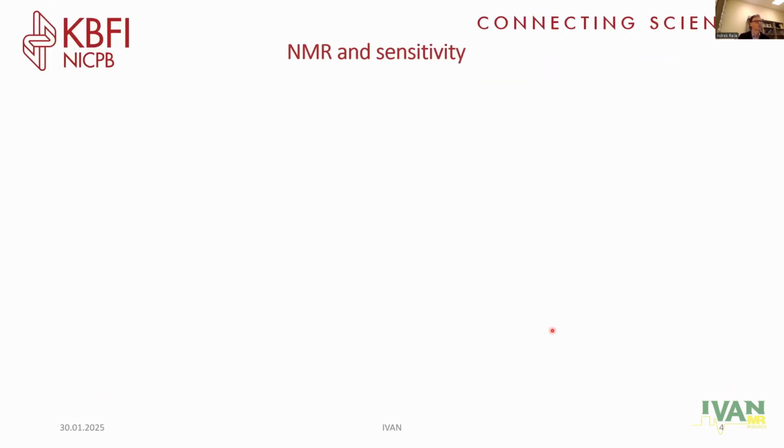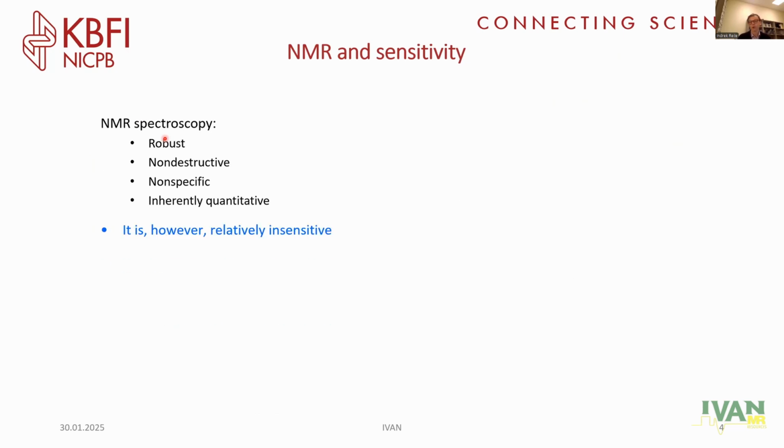Right. But of course, my own team's research is in the introduction a bit very similar by motivation to what Patrick said, that we do NMR spectroscopy and we all love it because it's a robust, non-destructive, non-specific and inherently quantitative technique. Probably everyone in the audience knows all of that. And all of us will also know that it's actually not very sensitive.